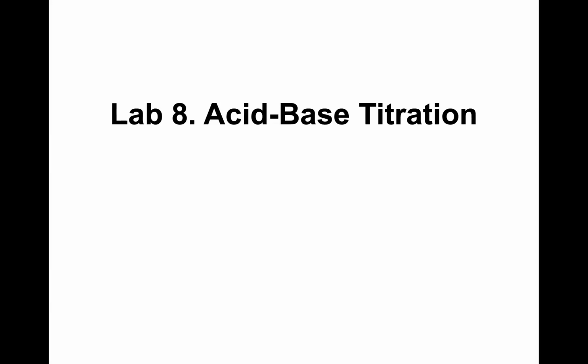Hi class, in this lab, we will do acid-base titration.